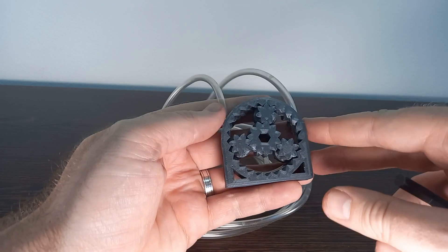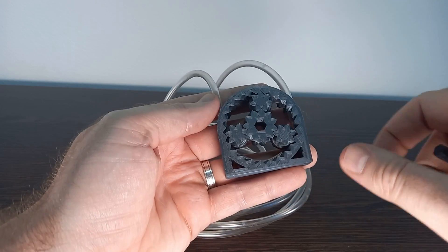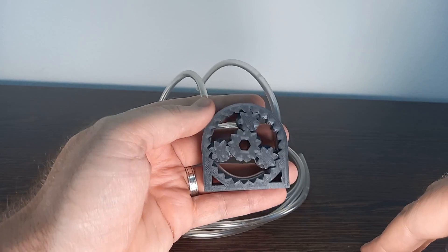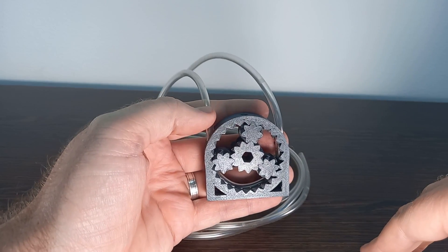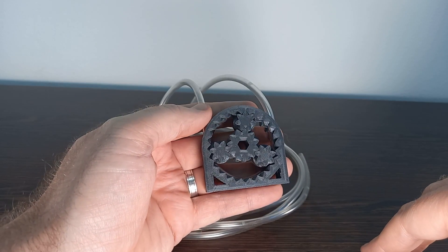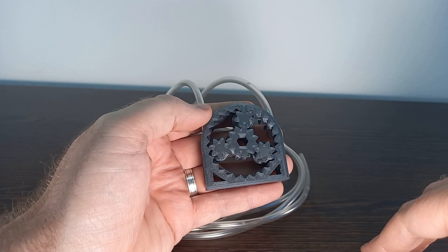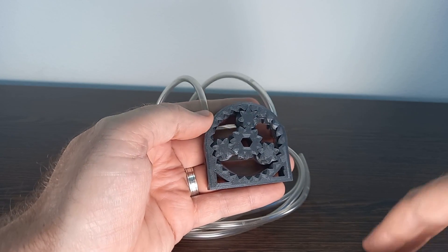I've already presented a video on a store-bought peristaltic pump. Here we have a simplified version of that that's just been 3D printed.